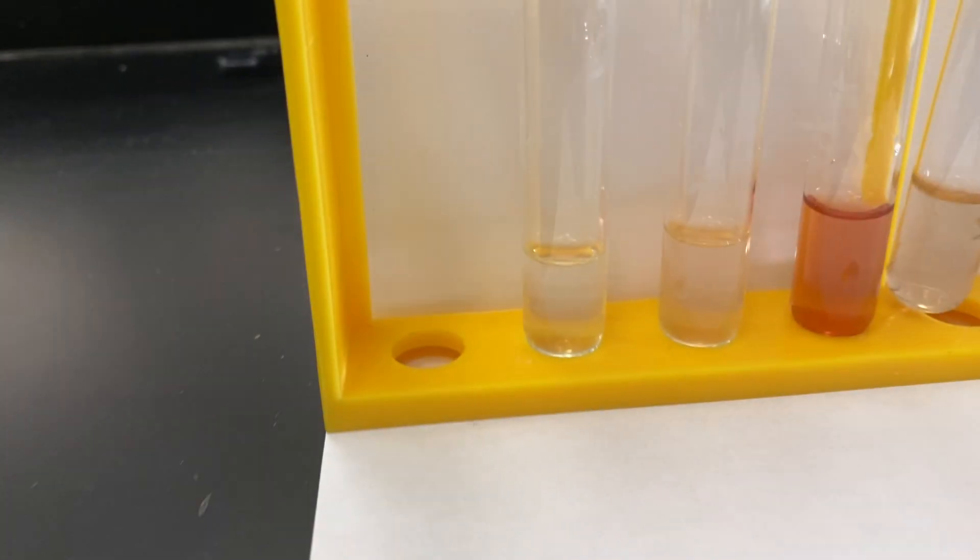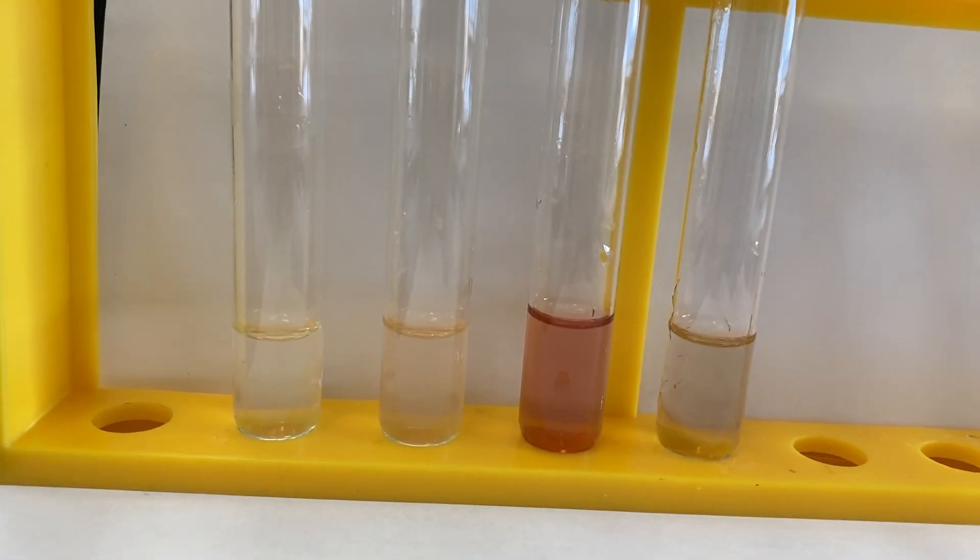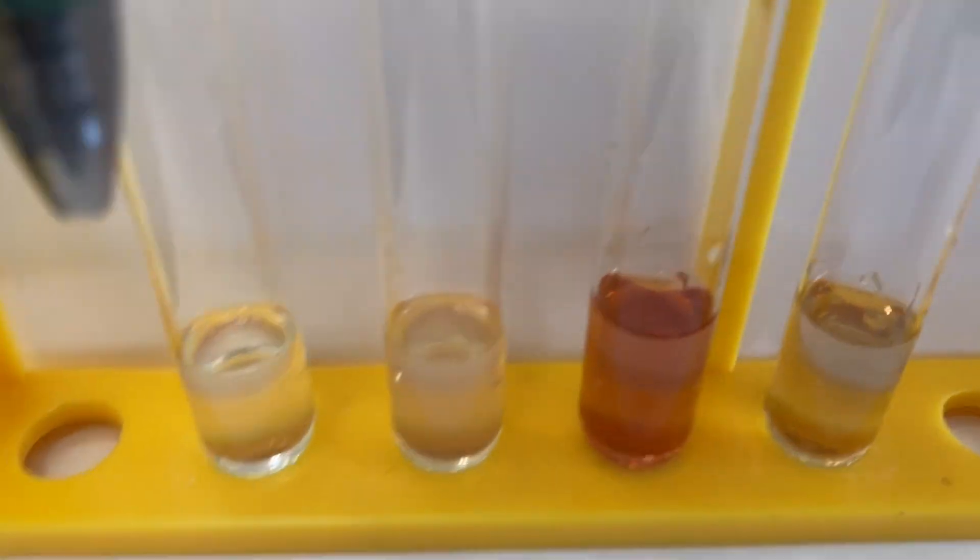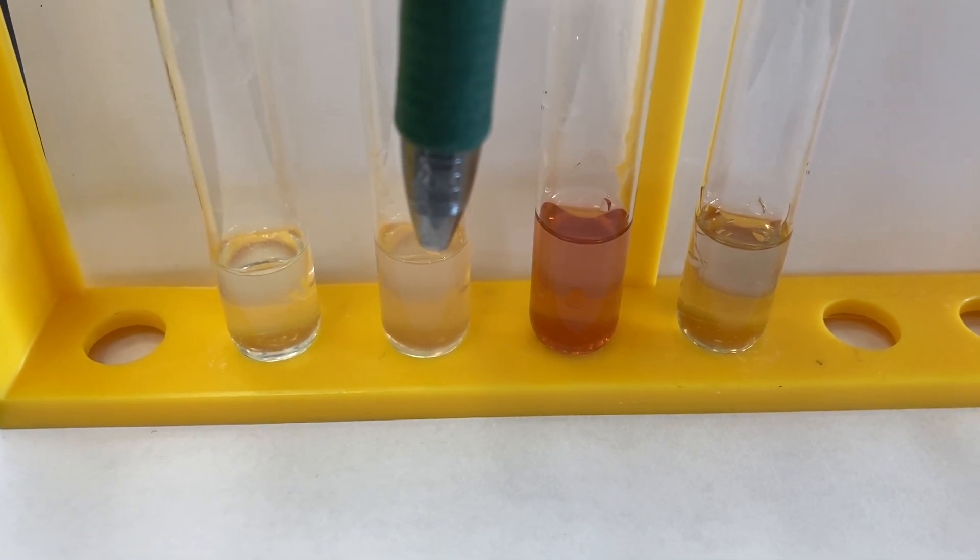Let's take a look at all four. Test tube A on the left, the one all the way to the left, that would be pH 1. The second one, pH 4.